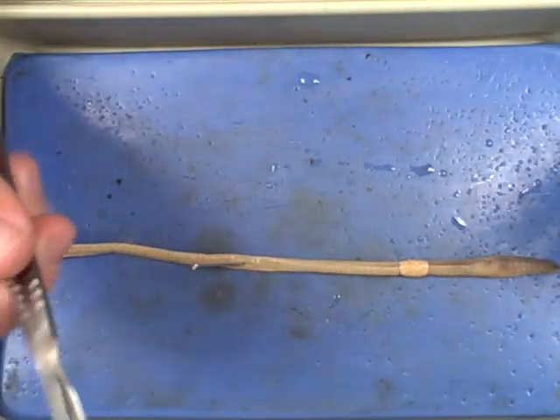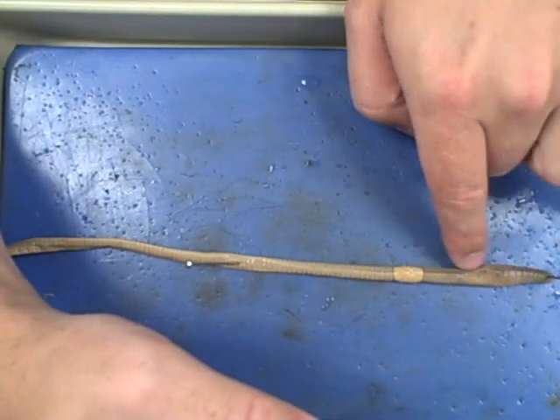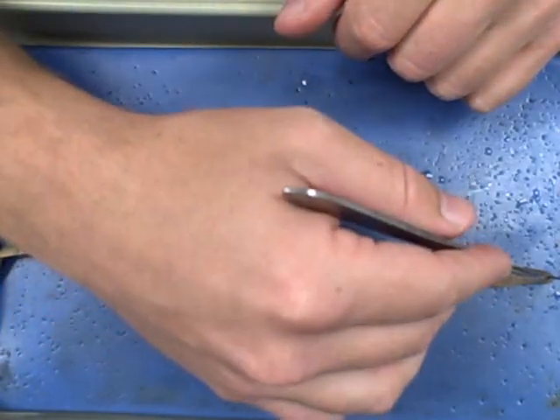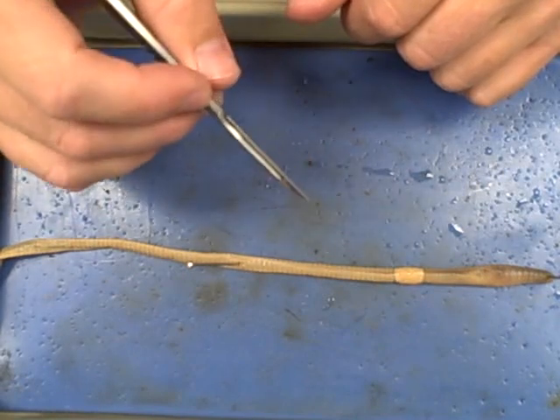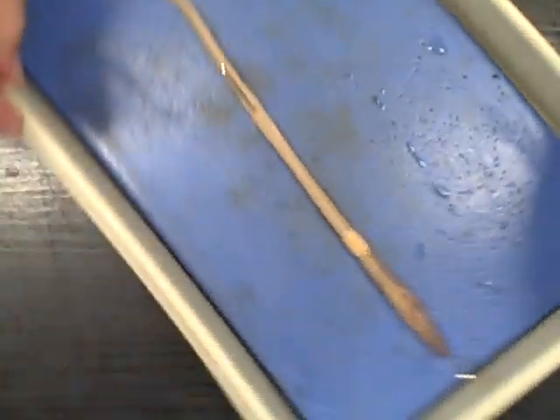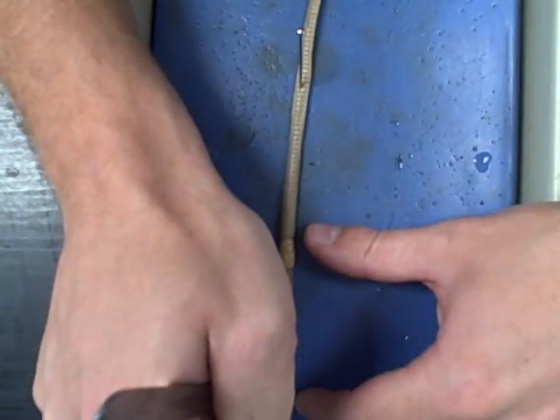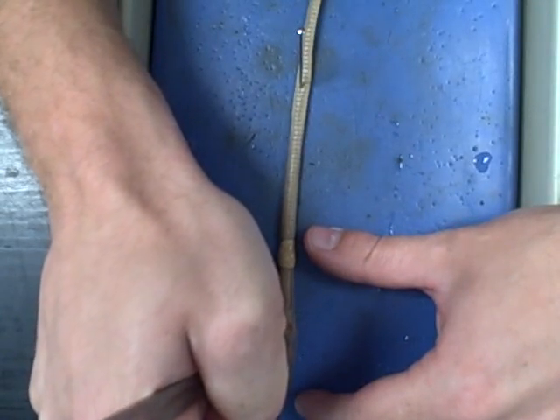Now you're ready for the dissection. To begin, first find the dorsal vein — the dark purple line going across. Take your scalpel and cut to the side of that vein, right or left. You don't want to go too deep, because if you go too deep you will cut through the organs, so you want to go nice and slow. Adjusting the tray might be a good idea too. Start near the top and make a nice cut all the way down.